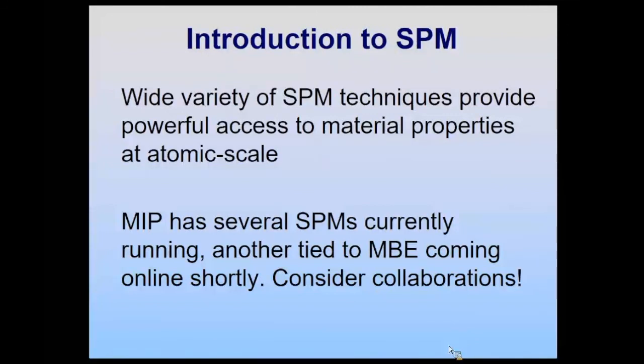So there, it has been done. Joe Strosio has an MBE system at NIST that's directly coupled to an STM system. It's hard because there are vibrations as you're moving around shutters and stuff in the MBE system, and that can cause problems with the SPM. So I'm not sure I'd actually want to be running them simultaneously if I was making important measurements in the STM. But certainly they will be coupled so that we can immediately take it out of the MBE and put it right into the SPM without breaking vacuum and make measurements at that point.